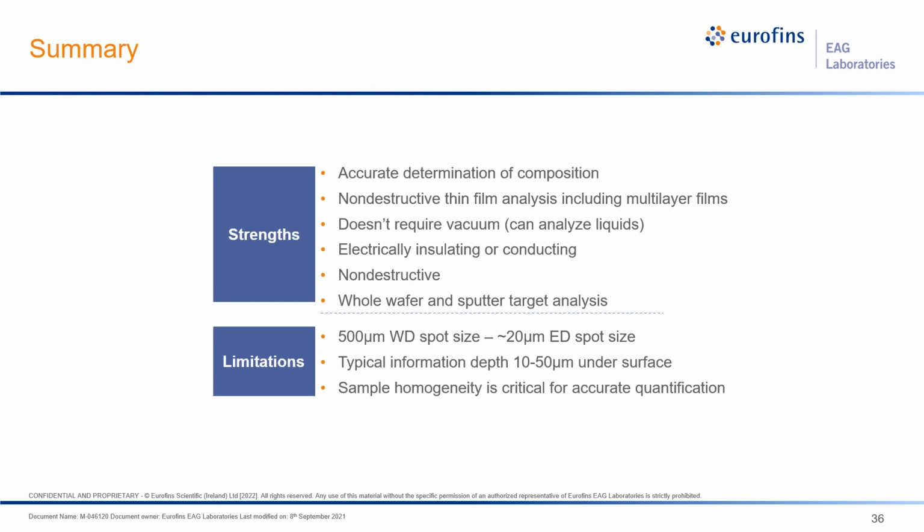ED-XRF affords much better sensitivity for micro XRF. However, considering techniques such as Auger electron spectroscopy or SEM-EDS, 20 microns is still a relatively large area to analyze, particularly when you're talking about semiconductor applications where devices on circuit boards can be very small.